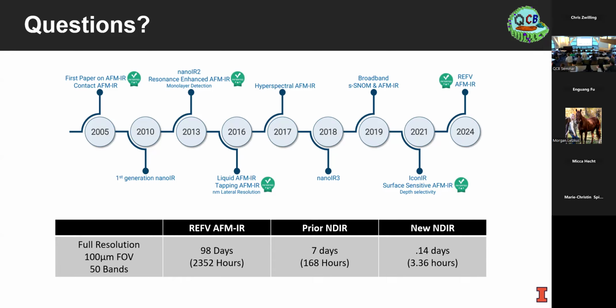So from our prior experience with infrared spectroscopy, if you have a mixture with about 20 components, you're going to be fine. You can actually resolve all those and everything's going to be okay. But once you start getting a larger number than that, you start becoming more and more ambiguous. And then your signal noise ratio requirement to resolve anything just goes through the roof. So there's a connection between signal noise ratio, sample volume, and the diversity that you have in the volume, and that's not physics-based, right? So it's not possible to predict a priori.